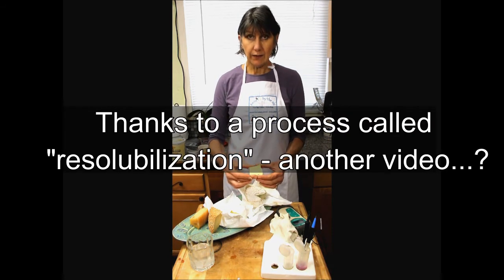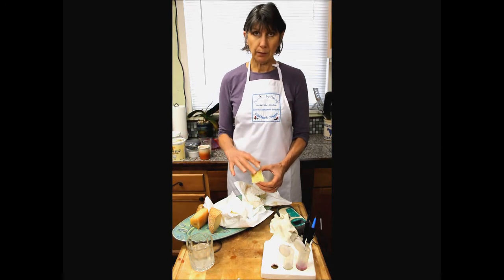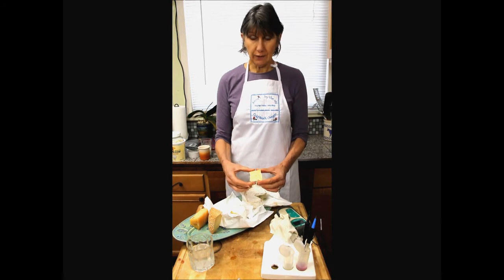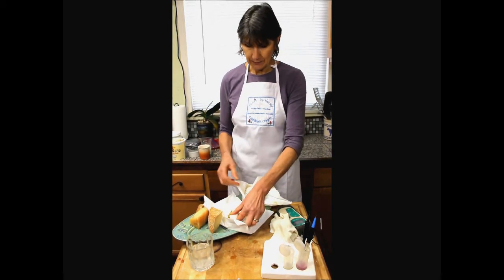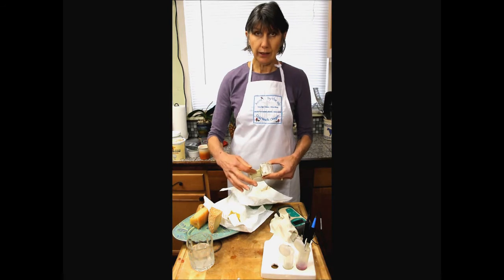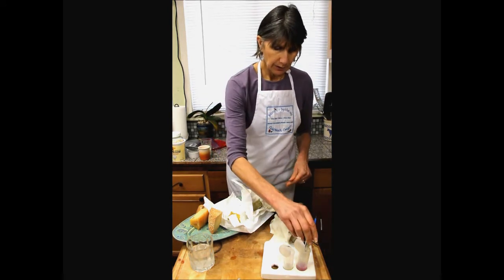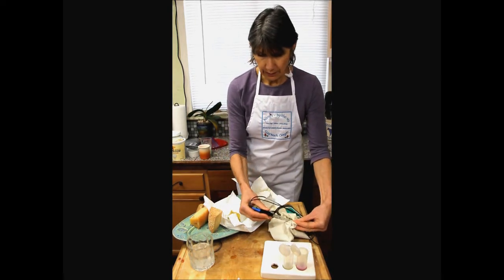If the cheese doesn't get the right ripening process or wasn't set up properly in the beginning, that will never happen. This cheese now, you can see it's firm still, so we're probably not going to have that much of a variation in the pH. This cheese, however, is very soft in the center, so we're going to see a very high pH. So 4.02 in our 4 solution, a little rinse and a blot.